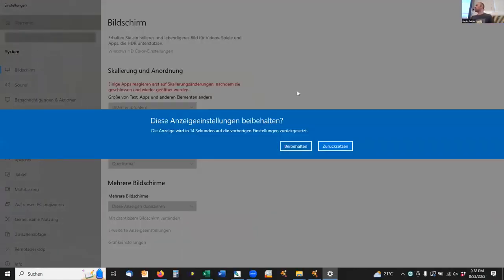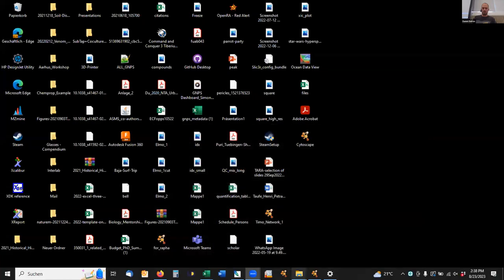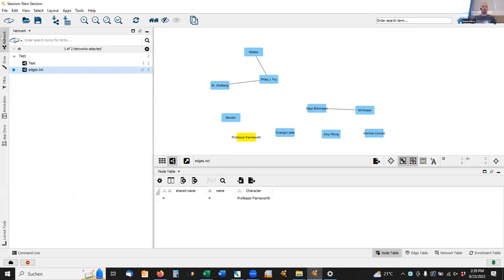Yeah, so you can just open them and check them out, but you actually don't need them. So I would suggest to just use the GraphML for now. Is this a little bit better to see now? But still too small. All right, let's see. Is it okay? All right.